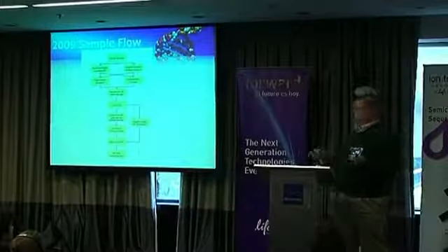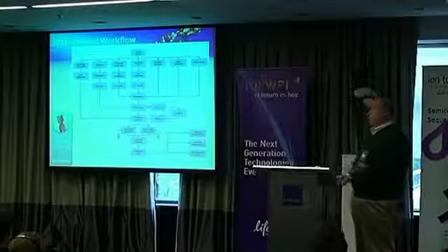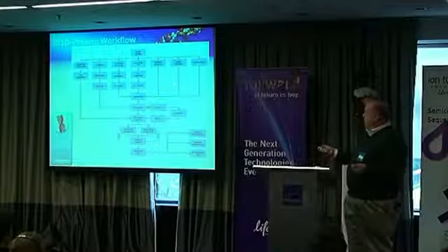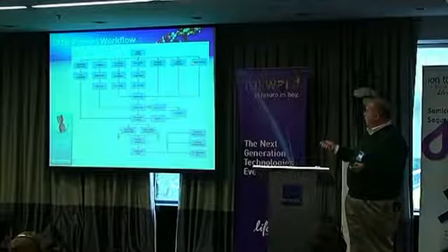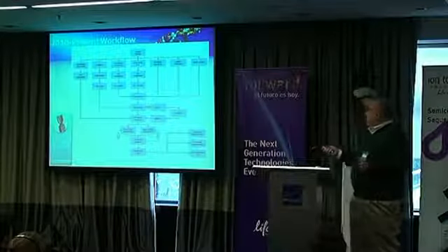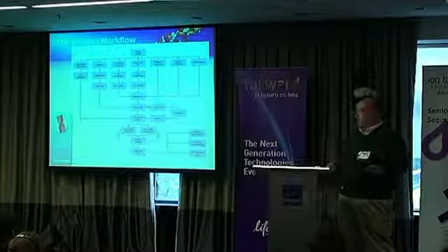But with this industry and everything sort of exploding, this is what we looked like in 2010. We go from one process to several, ranging from short read amplicons all the way to whole genome. Now, I should tell you that for the most part, we outsource our whole genome. We're not staffed for that as of today. And all these processes feed our three instruments, Ion Torrent and then the two competitors.